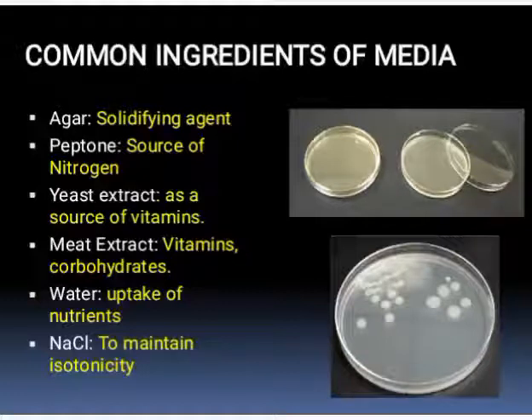3. Yeast extract, which acts as a source of vitamins. 4. Meat extract. This is a source of vitamins and carbohydrates. 5. Water. Water is used for the uptake of nutrients. 6. NaCl. NaCl is used to maintain isotonicity.